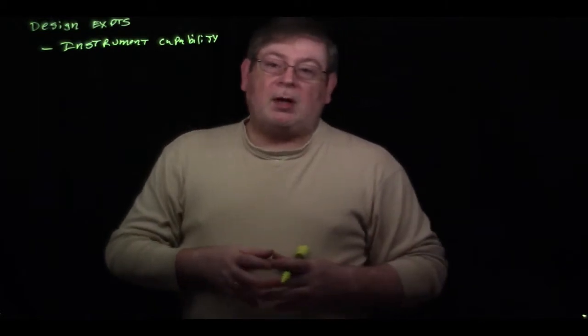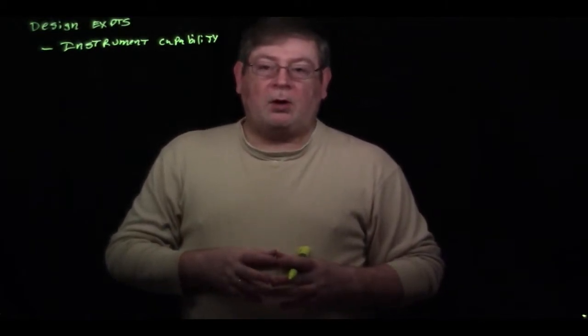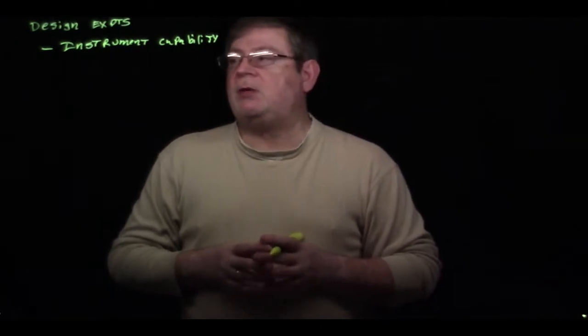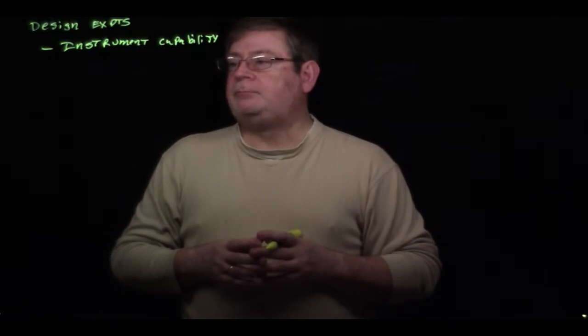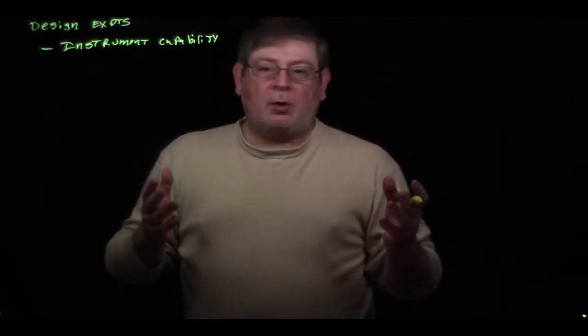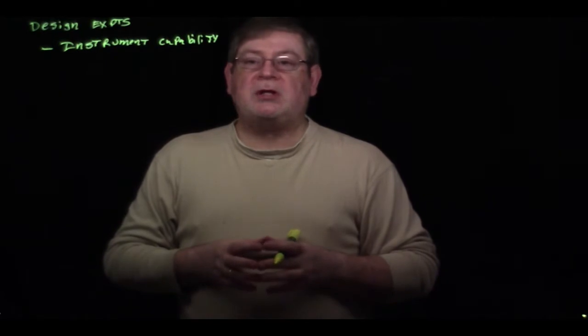So you always need to think about, is this experiment going to be more appropriate for MALDI? Or is the experiment going to be more appropriate for electrospray or APCI? And we've talked about those various ionization methods that we have at our disposal here at the University of Southern Mississippi. So as an example, if you were going to do an analysis of a synthetic polymer, not a biomolecule, you're probably going to want to focus on something like MALDI.